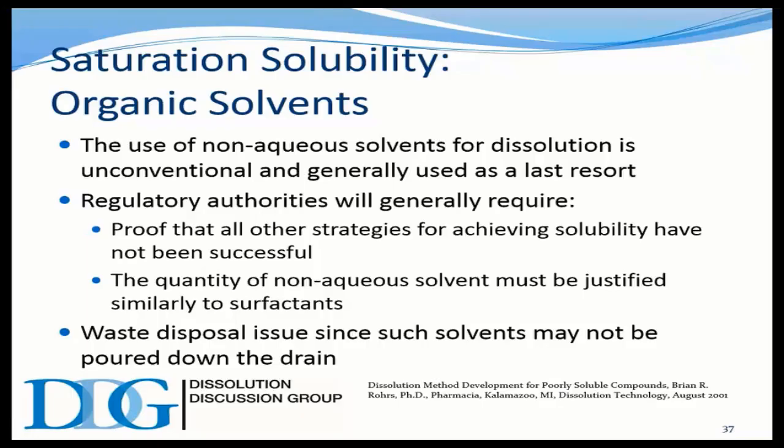Are there salt forms of the API that would be better? Things like that. So when everything has been exhausted, and if this is the form we have to deal with, then of course the use of organic solvents or non-aqueous materials may be required. But again, significant justification needs to be given for that as well, because like surfactants, with too much of it you'll lose discrimination in the test. And for many drug products, any amount of alcohol can really affect those discrimination capabilities of the test.